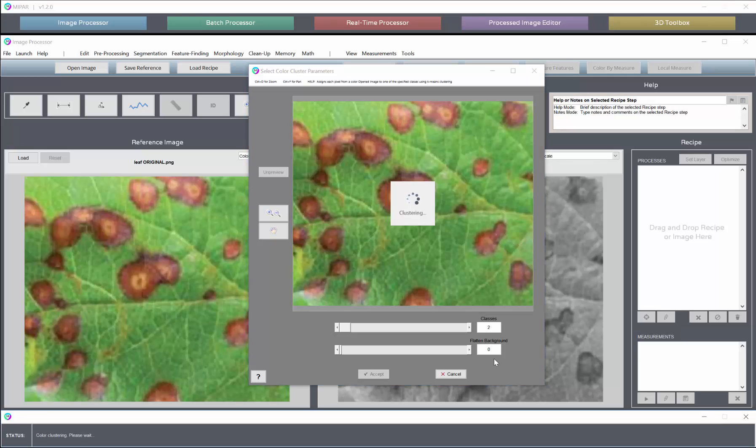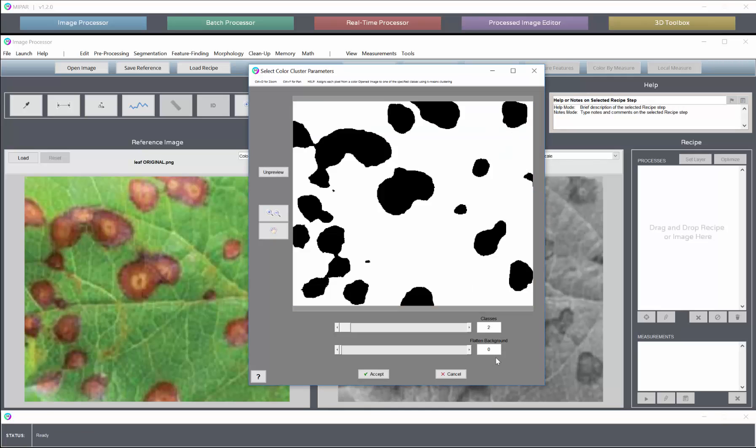It will look at the color space in the image and divide it up into two classes, and then assign each pixel to which class it should belong.